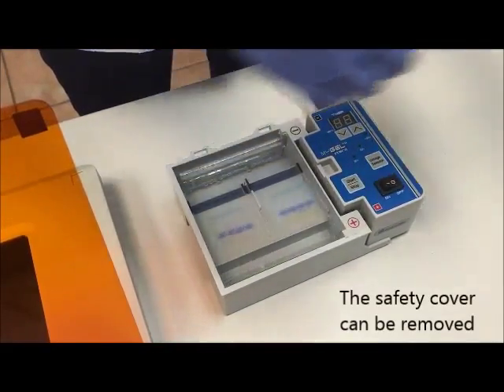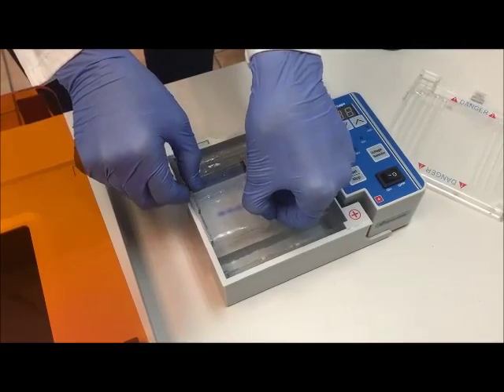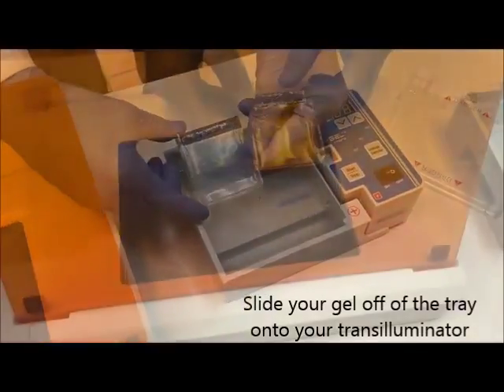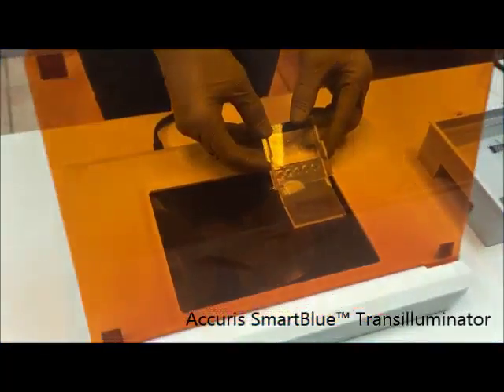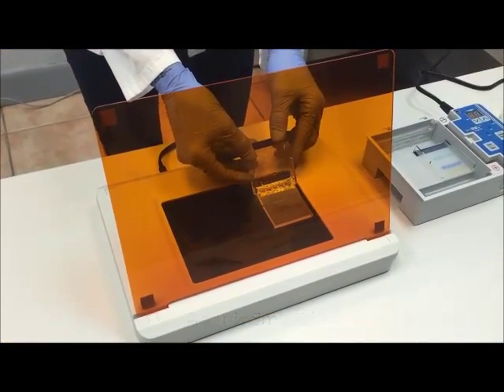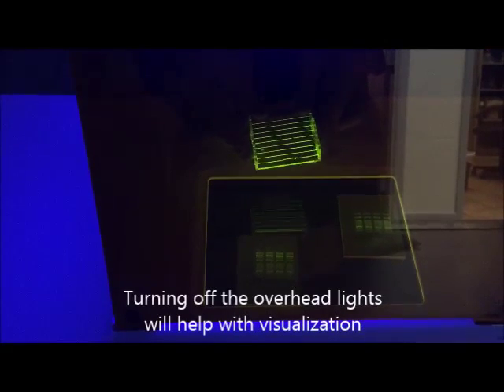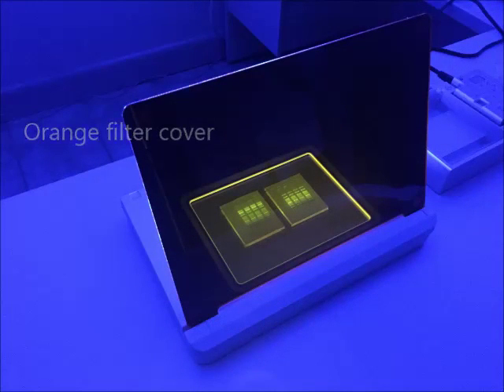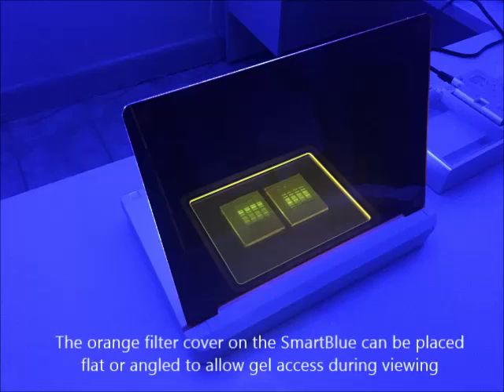You can now remove the lid and remove your gels. Now it's time to view your separated DNA. The gels can be removed from the gel trays by gently pushing on one end. We're using the Acuras Smart Blue Transilluminator, which emits a blue light at 465 nanometers — ideal for excitation of most safe green stains, such as the Smart Glow stain we've added to our samples. The blue light excites the Smart Glow stain attached to the DNA molecules. The orange filter cover on the illuminator blocks the blue light and allows us to clearly view the fluorescing DNA bands. The orange cover can be placed flat on top of the viewing surface or angled to allow access to the gels.